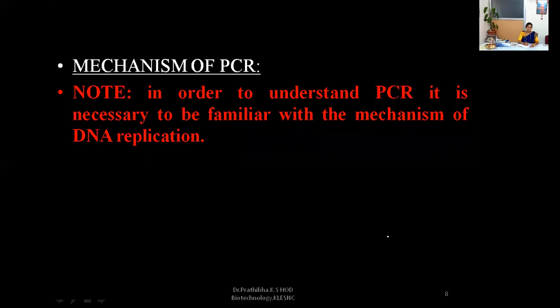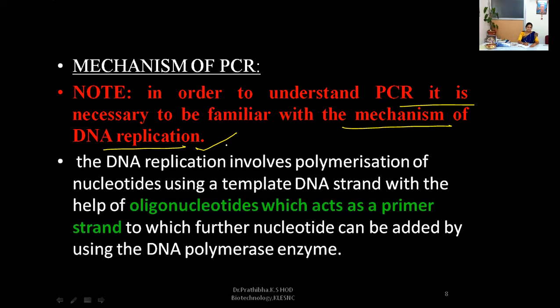Now let us go through the mechanism of PCR. In order to understand PCR, it is necessary to be familiar with the mechanism of DNA replication. What is happening in DNA replication? It is the same concept we have done in PCR. This DNA replication within the cell system, which is the in vivo condition, is the same mechanism we are applying in the PCR machine in the in vitro condition.